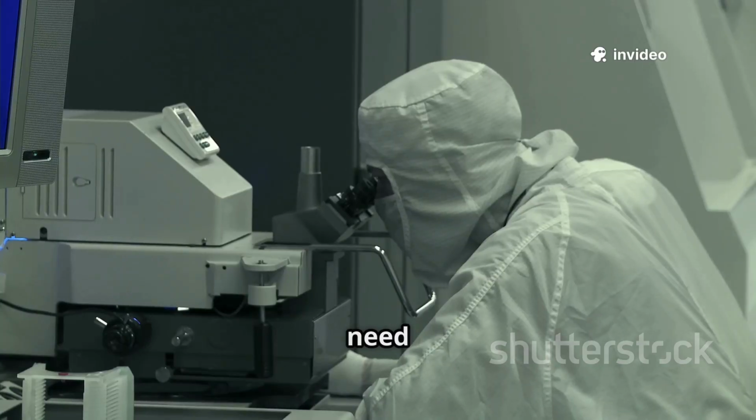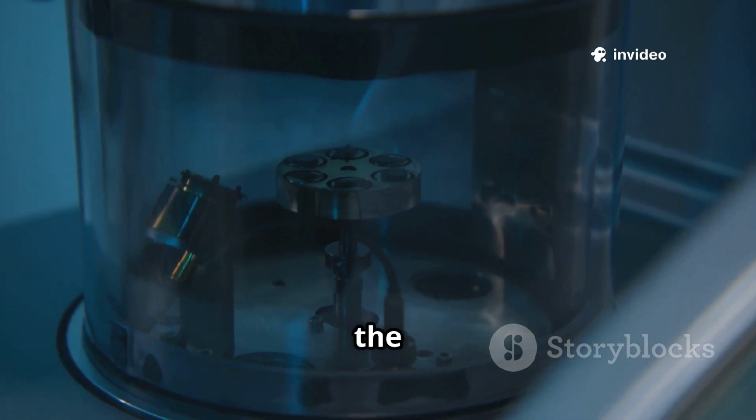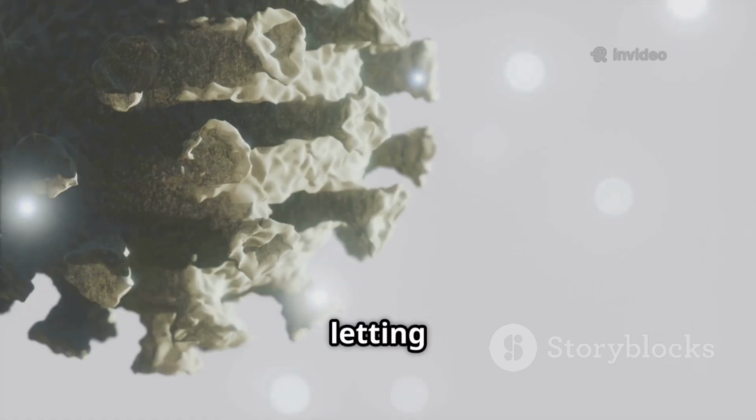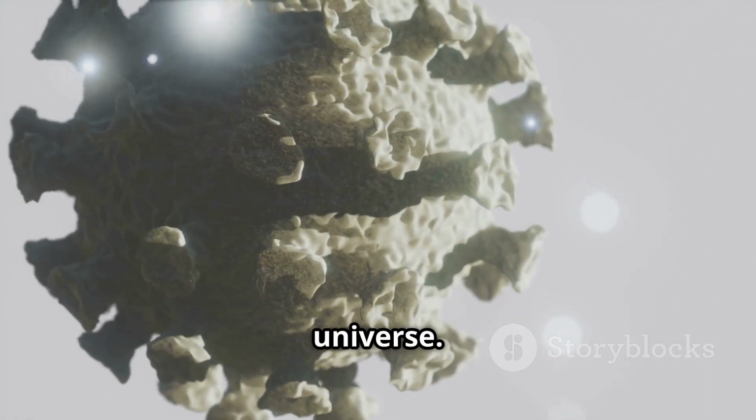To work, SEMs need a vacuum, so electrons travel straight to the sample without bumping into air. This creates a clear path for electrons, letting us unlock the secrets of the tiny universe.